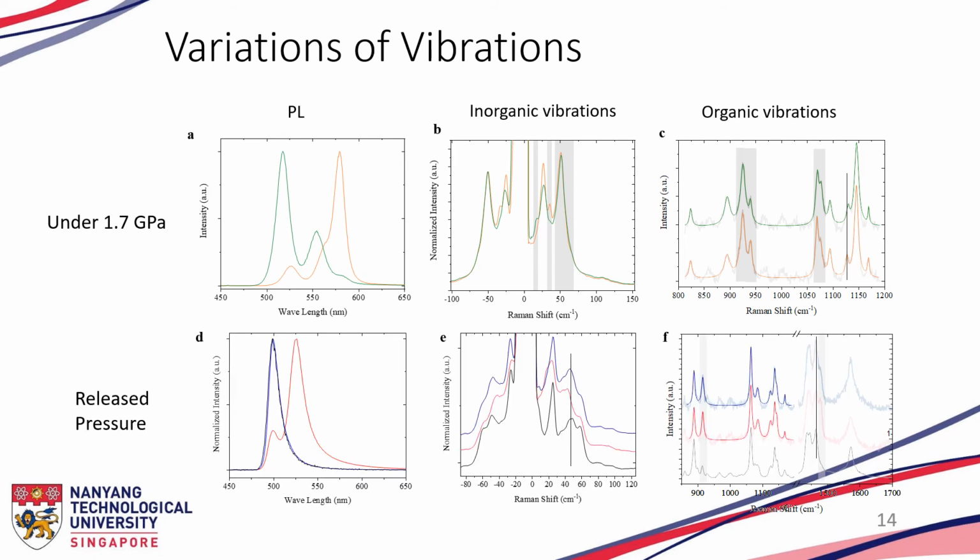Some peaks shifted, and in some places the intensity is different due to different contributions of the particular bands. A similar analysis was performed for the 2 different types of domains appearing after the pressure was released. The blue line corresponds to the reversible part, the red line is the irreversible part, black is before compression.